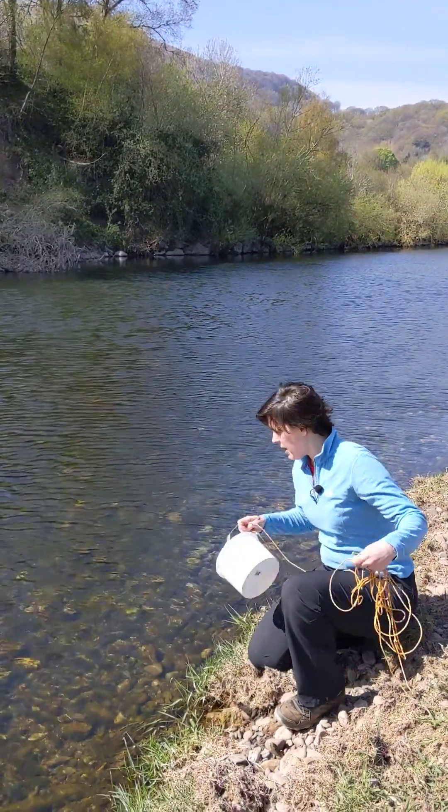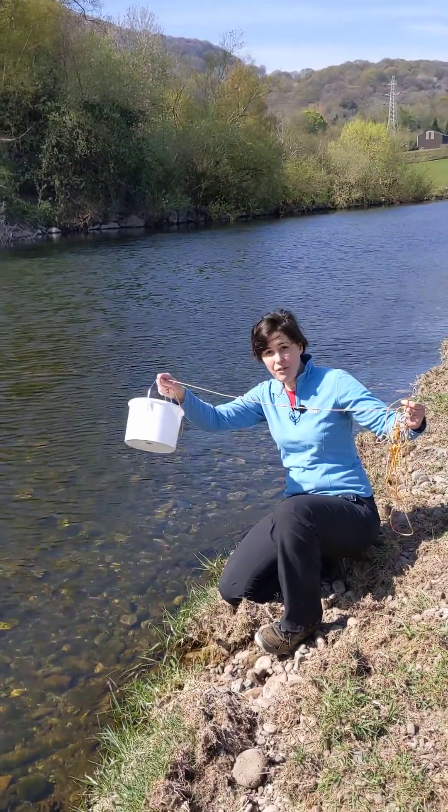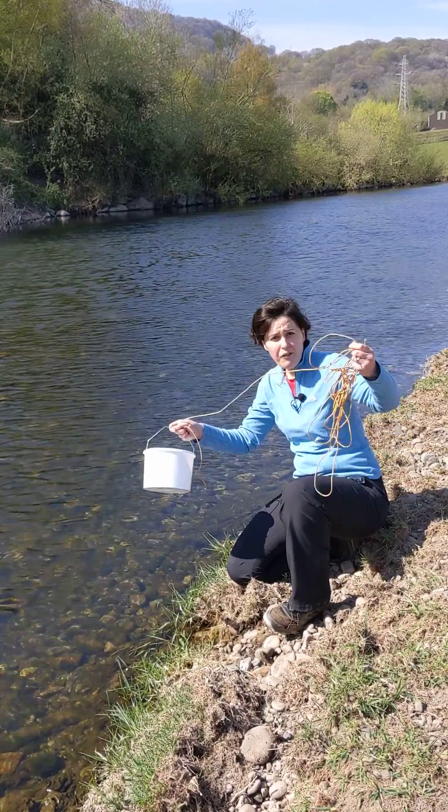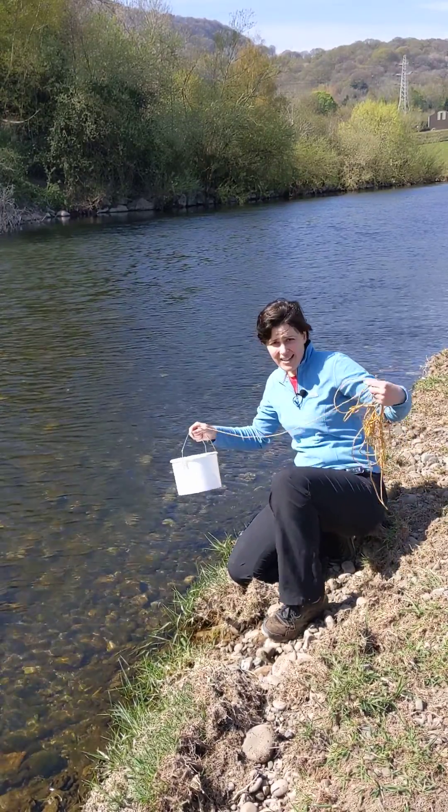Approach the river and bend down. With your sampling device — you can use whatever you like: a bucket, a bottle, whatever. I've got a piece of string on it just in case I accidentally let it go.